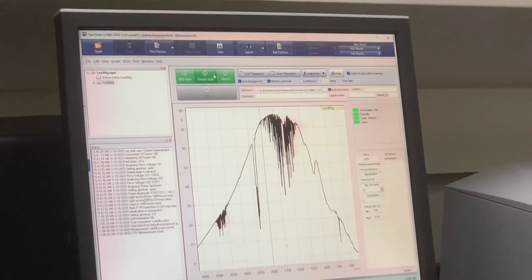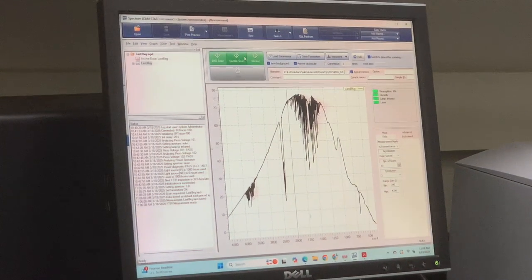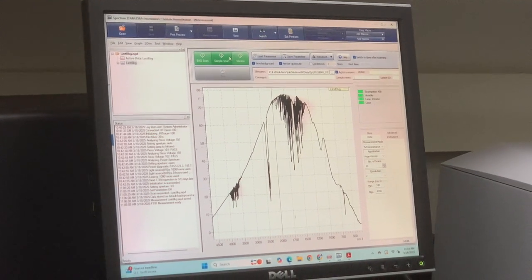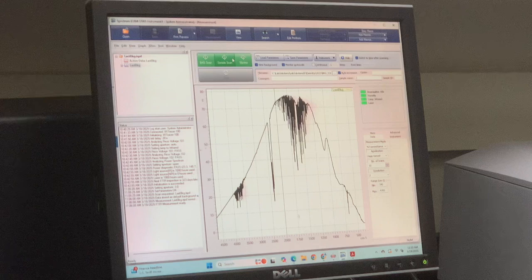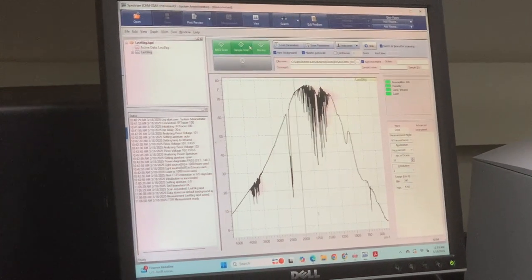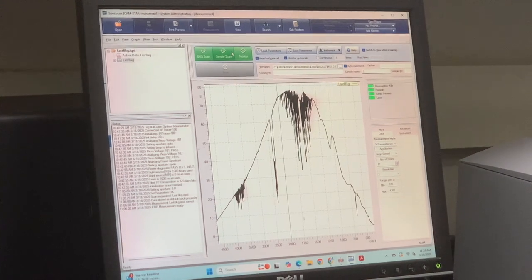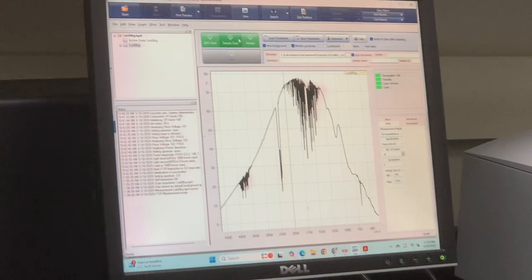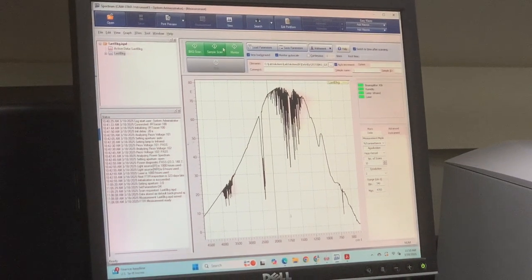Maybe an epoxy that hardens very quickly, or your phase change material. No, not that, because the phase change takes place at a specific temperature. You're saying that you just monitor the reaction going through part of time. But it's really any changing parameter. You're monitoring it, so you're looking at it over time. It's real-time monitoring.